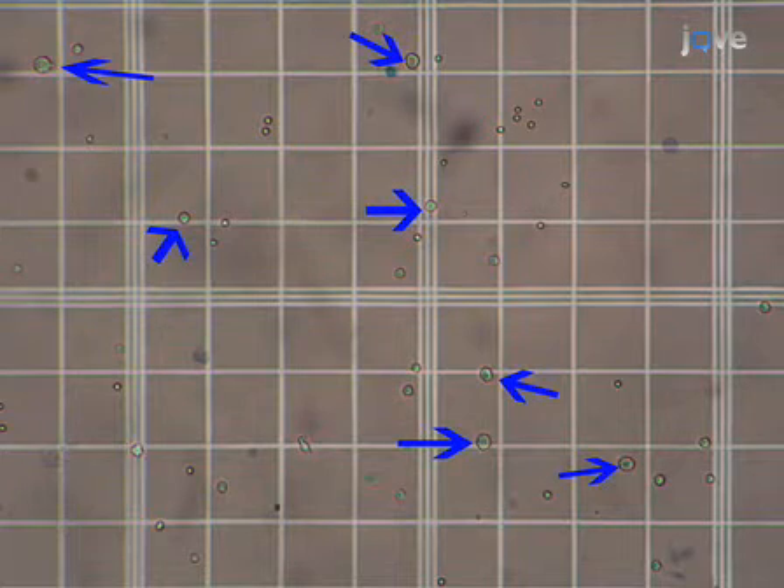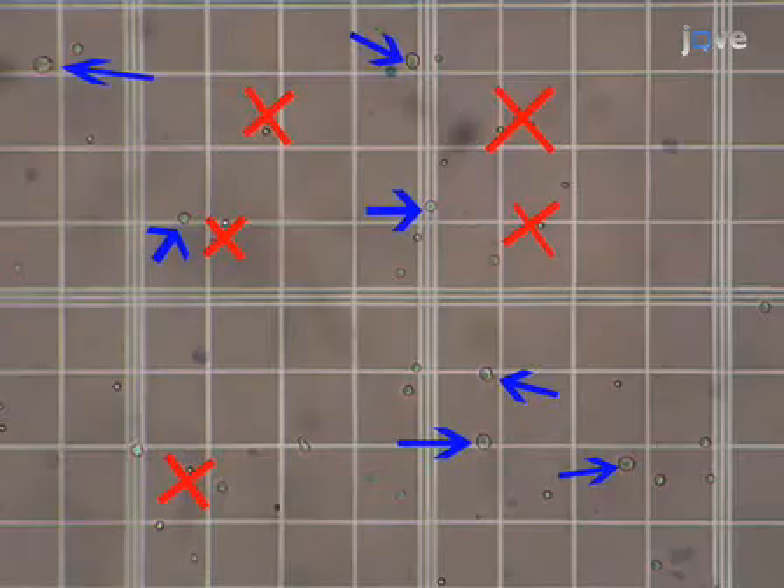For plating we must count the bone marrow cells but not the erythrocytes. These are the biggest and brightest cells. For example, in this field we would count these cells but not these ones.